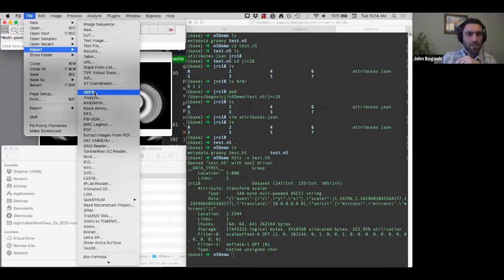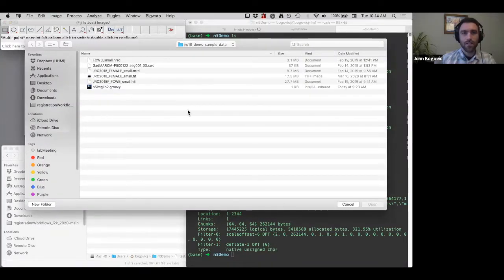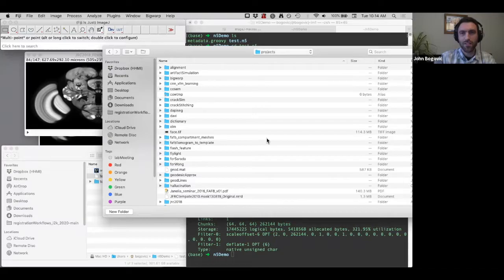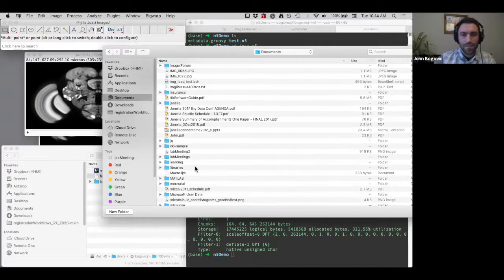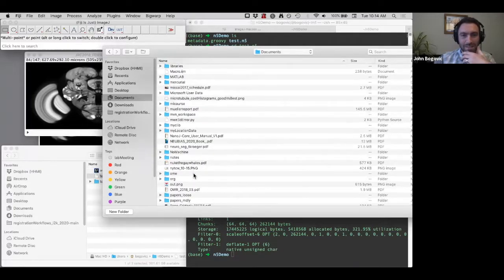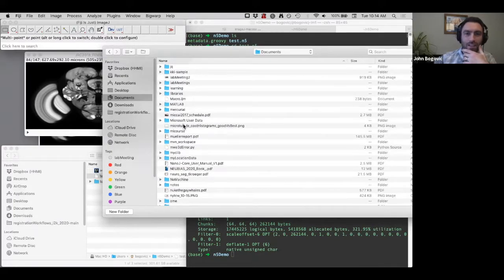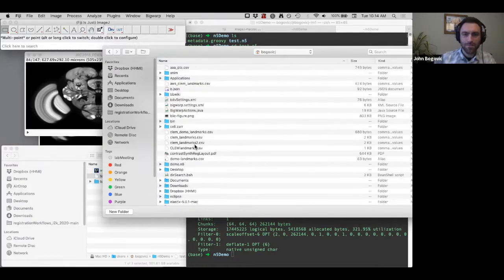And I guess I'll show you just a little bit more evidence. If you go to File, Import, HDF5, this is an older plugin that Fiji uses that enables reading HDF5 files. And I'll just open it this way too, and we'll see that it actually wrote it, and it's understandable by other things. So again, this is so far really simple. I'm just writing things in a bunch of different ways. And while I find this folder, I'll just talk a little bit about some of the trade-offs between some of the formats.